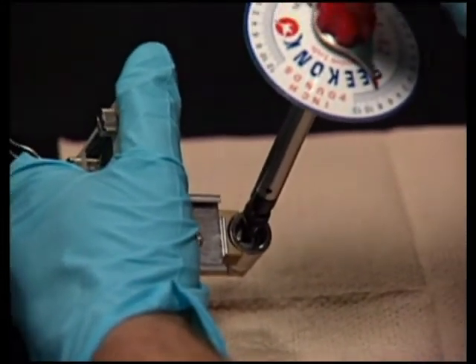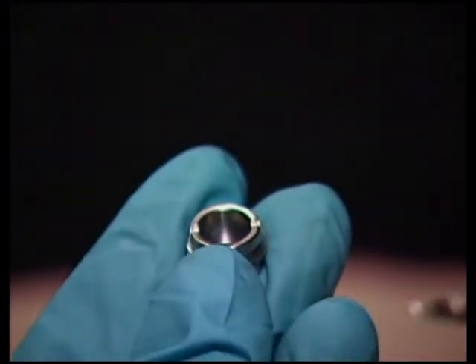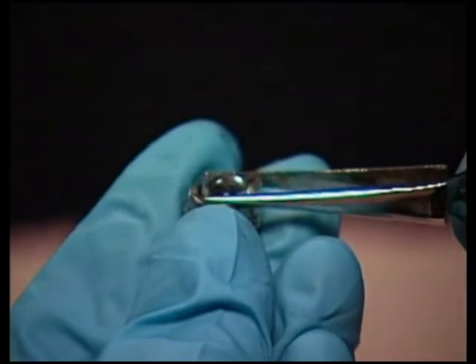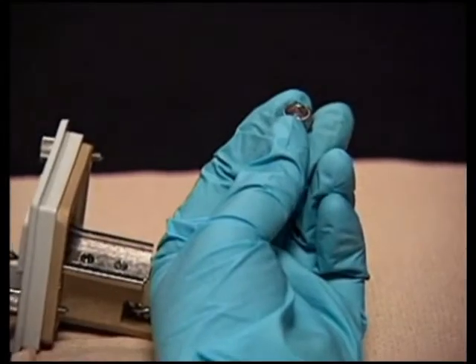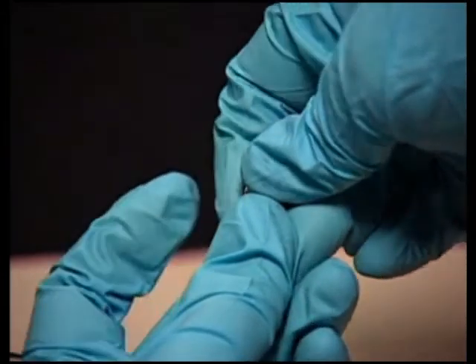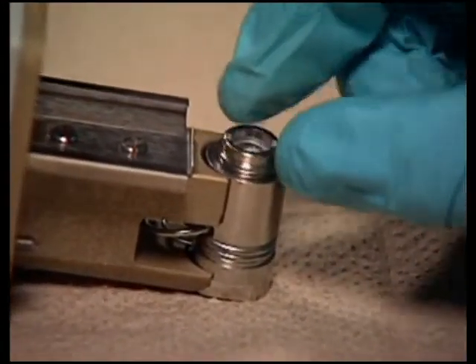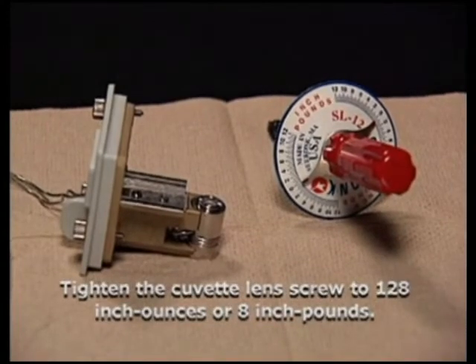Next, with the cuvette lens curved side facing up, replace the cuvette lens in the cuvette lens screw mount. Using your fingers, place the split ring onto the cuvette lens and press it firmly until it is flush on all sides. Screw the cuvette lens screw into the exit lens screw mount end of the flow cell body and torque to 128 inch ounces or 8 inch pounds.